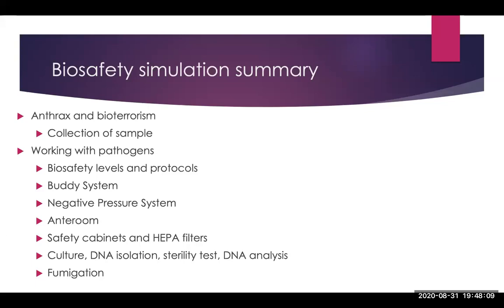Okay. They're going to talk about a negative pressure system to keep that safe environment, and an anteroom, again, also to maintain this safe environment and prevent microbes from getting out into the environment. They're going to talk about safety cabinets to protect you and protect your work. So you work inside of a safety cabinet, which you may or may not have done before, but you'll see it in the simulation. And then the test that you'll run is you'll do a culture of this sample.